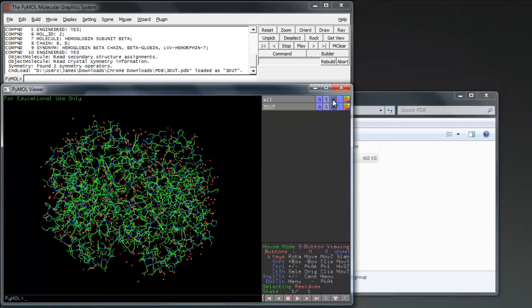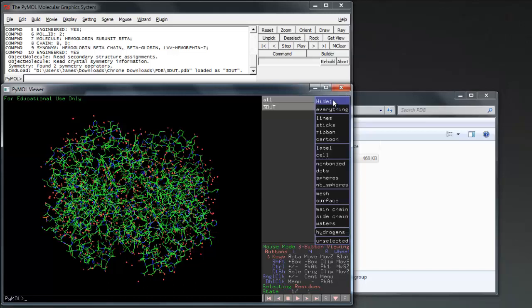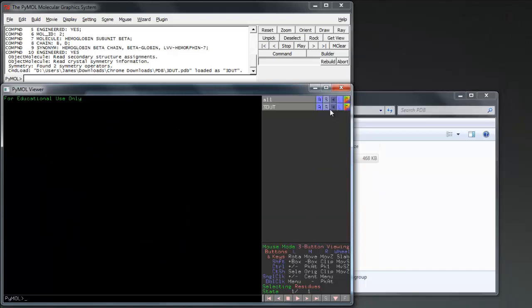L stands for Label, but we won't be using this function. If you wish to label your image or protein, it is much better to do so using Paint or Photoshop. Go ahead and hide everything.